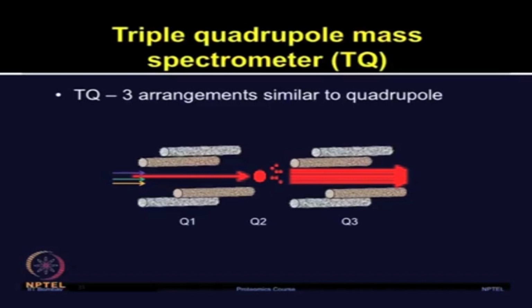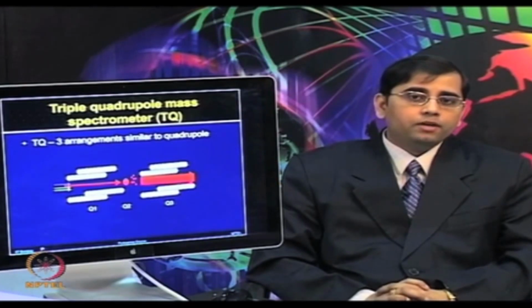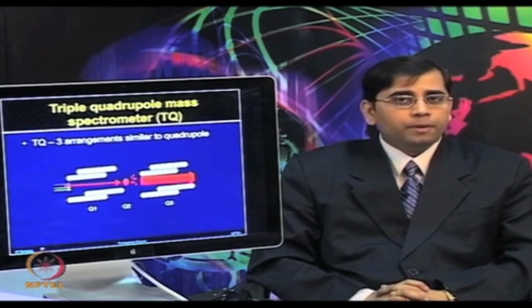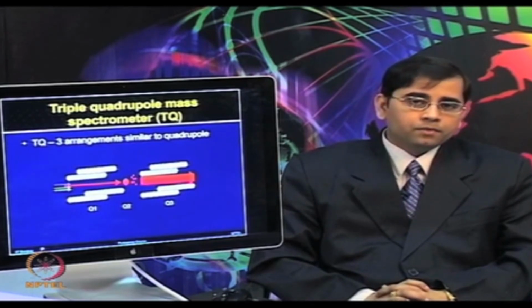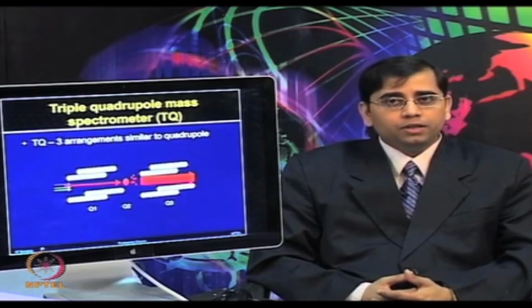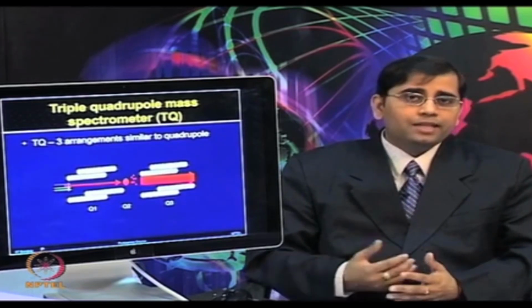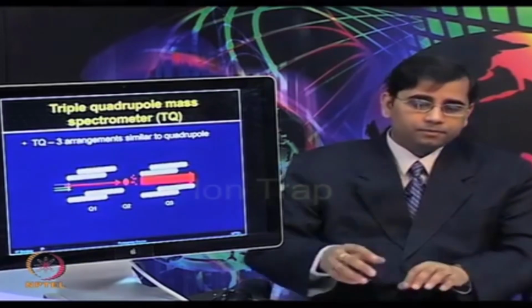Q3 scans the stream of ion fragments which are emerging from the collision cell to generate a collision induced dissociation spectrum. The mass spectrum of fragments derived from one peptide is generated after one analysis is complete. Then Q1 directs a different intact peptide into the collision cell. So, in this sequential manner, it can process various peptides.